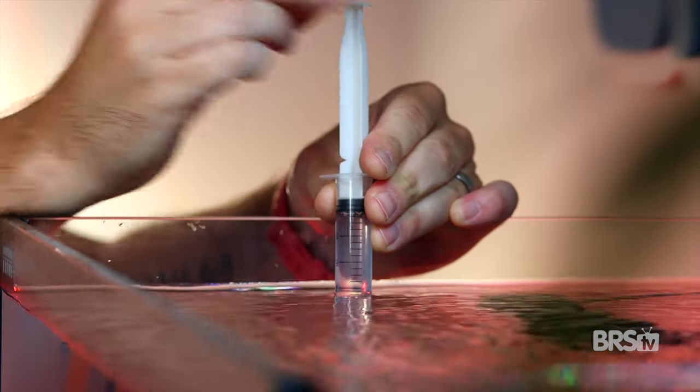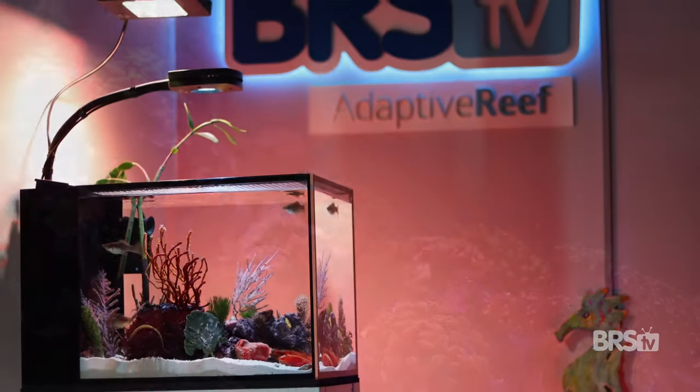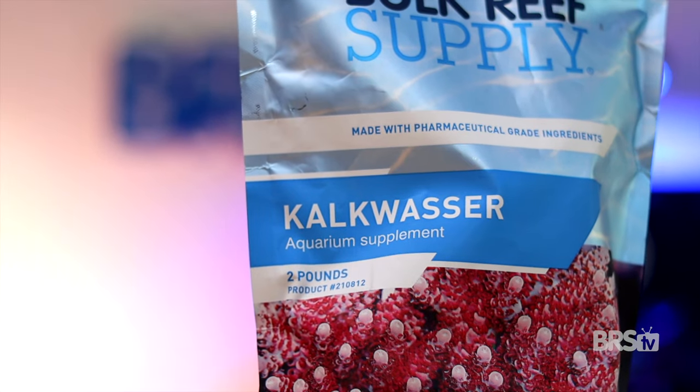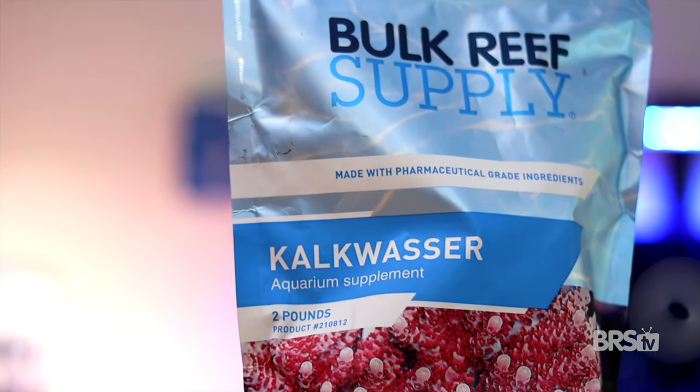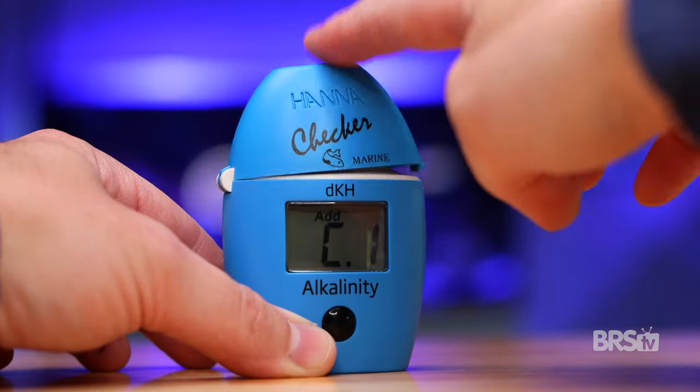I test all of my tanks for alkalinity at least once a week. That allows me to make subtle changes in my dosing regiment as needed. I've especially found the checker extremely handy since I've started dosing Kalkwasser, as getting the right concentration can be a bit tricky when you're starting out. Out of all of the Hanna products that I use, this alkalinity checker is by far my favorite, as I'm able to test all three tanks in under three minutes.